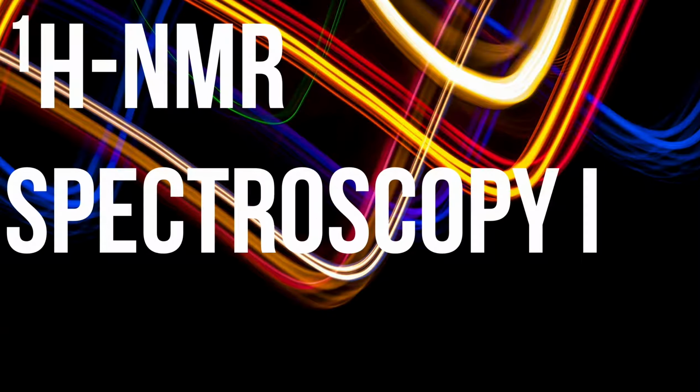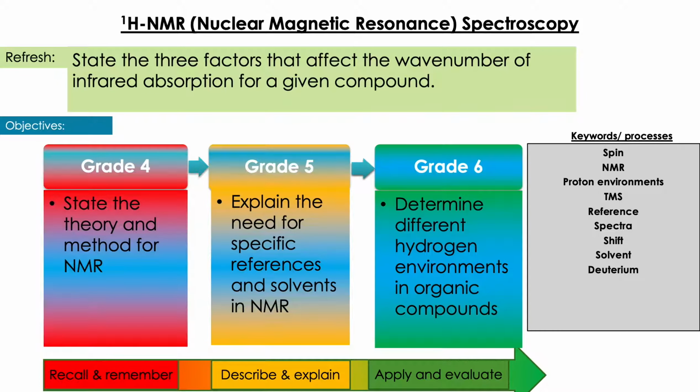In this video, we're going to be continuing our odyssey into structure determination and introducing a new technique, that's proton NMR spectroscopy. We're going to have this video in two parts, and in this part, we're going to be looking at the theory and what a hydrogen environment is.